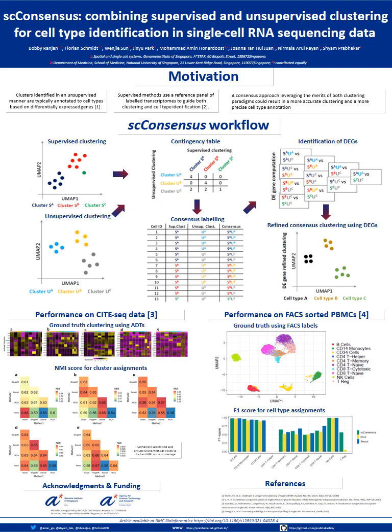So these consensus labels are nothing else but identification for the cluster identity a particular cell is assigned to by both input methods. And using these consensus labels, we go ahead and call DE genes between all consensus clusters, and we use these DE genes as feature genes to recluster all our cells in this consensus space. And this is actually where we really can see the improvement of the merging of the two clustering results.